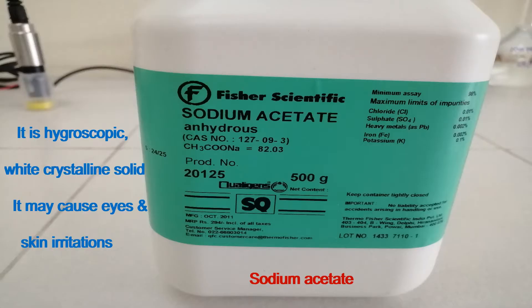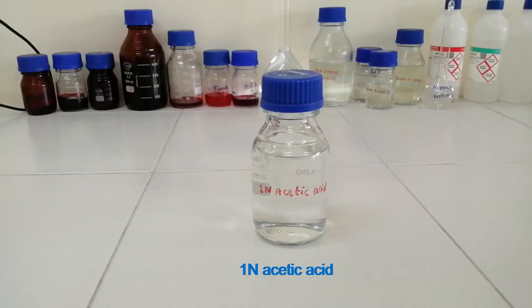This is Sodium Acetate. It is a hygroscopic white crystalline solid. It may cause eye and skin irritations. This is 1N Acetic Acid.